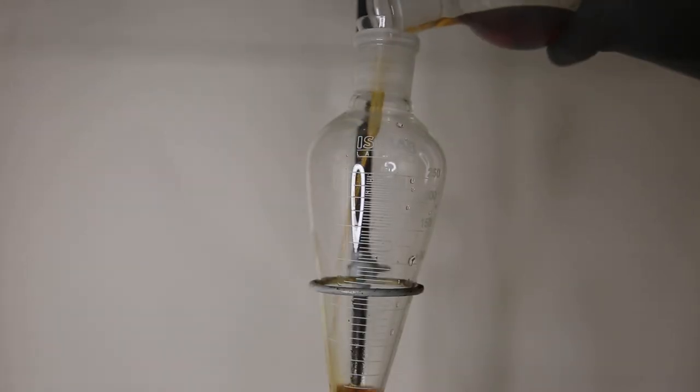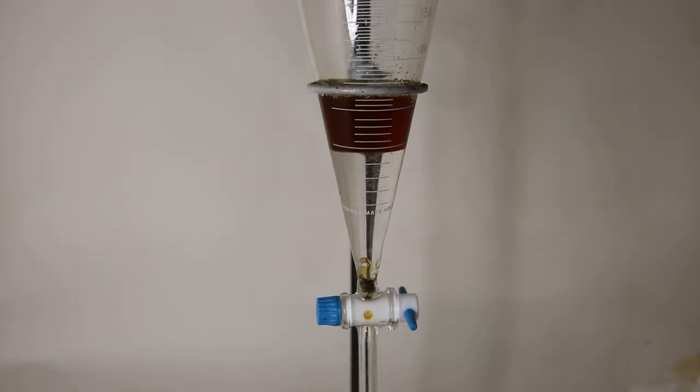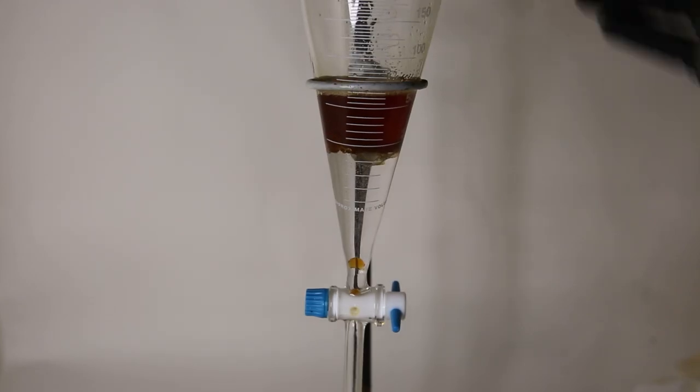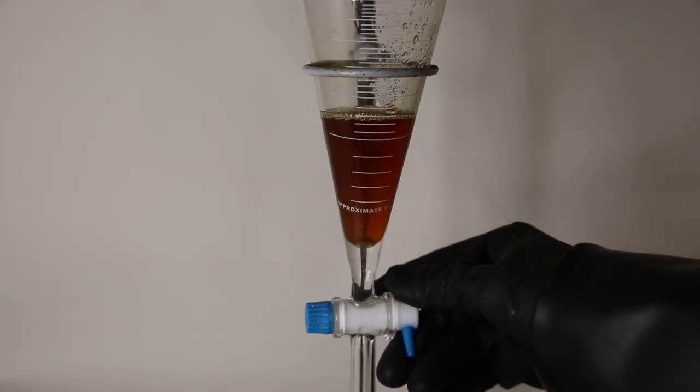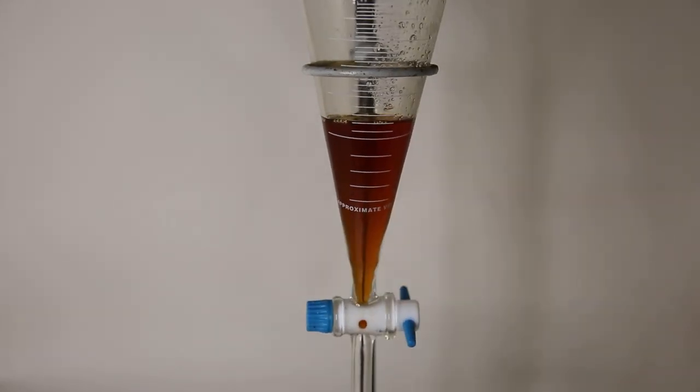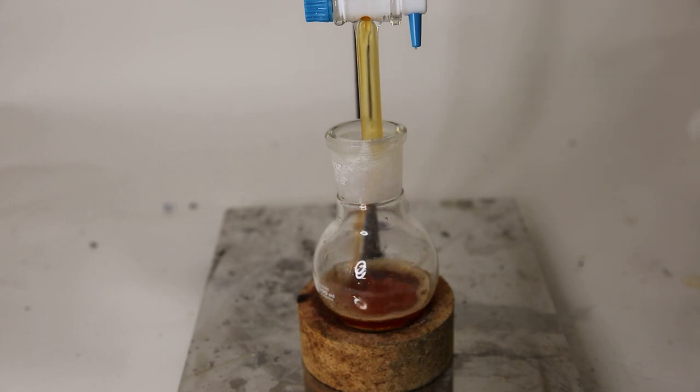So now I will just wash the benzene several times with some water. Then I drain the benzene layer into a flask containing some calcium chloride, which will absorb some of the water.